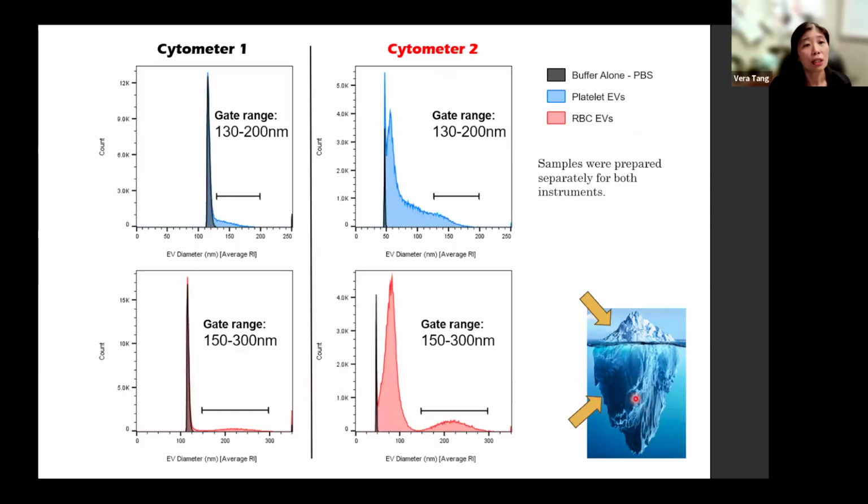So now I'm showing you data on cytometer 2. So if you remember, the goal of reporting in standard units, of being able to quantify exactly how much of a population we're looking at, is so that we can compare data. Now, cytometer 1 and cytometer 2 have drastically different sensitivities. So you can see the limit of detection. So where that PBS, that threshold trigger is a very different value. And because I have calibrated units that are standard units, I can directly compare between the two cytometers.